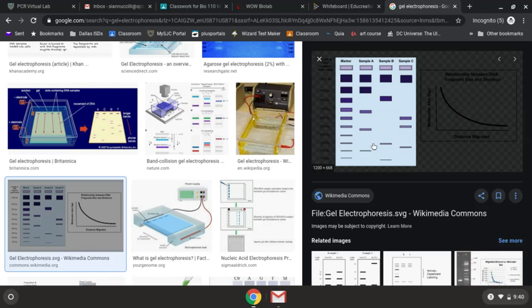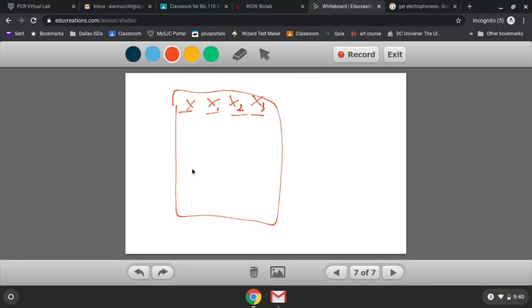And that's what we do as scientists. As scientists, what you do is you compare the bands. How many bands line up, right? None of these samples, A, B, or C, are exactly alike one another because none of them have the same pattern. This pattern differs from this pattern and differs from this pattern. So none of these patterns match. What we want is a matching pattern, right?